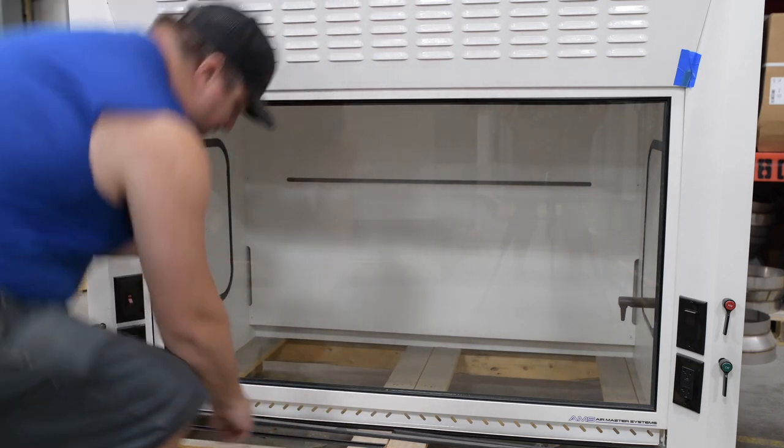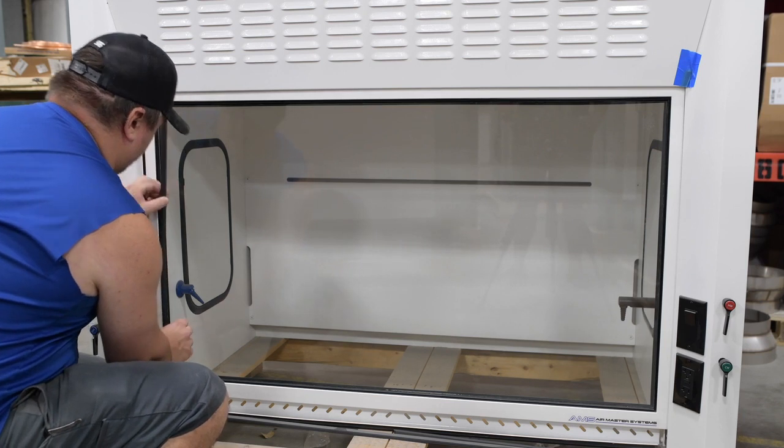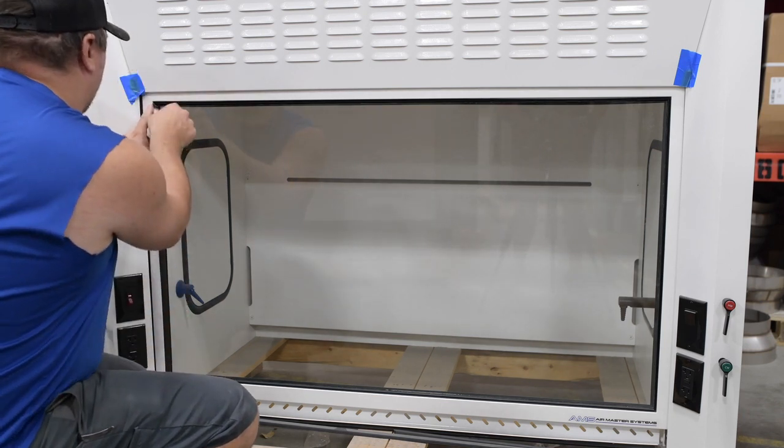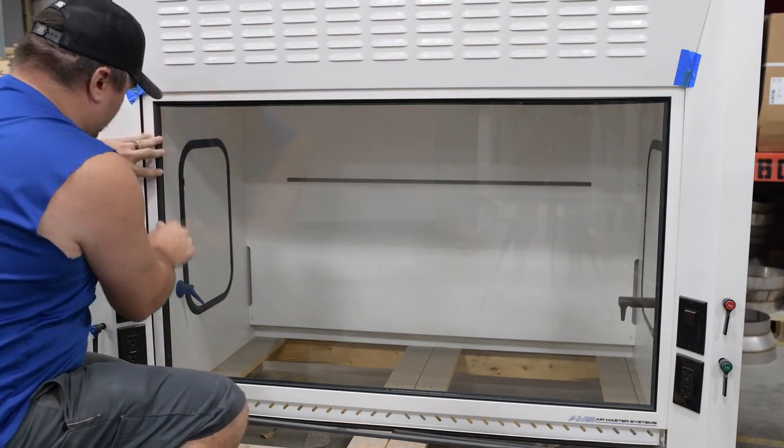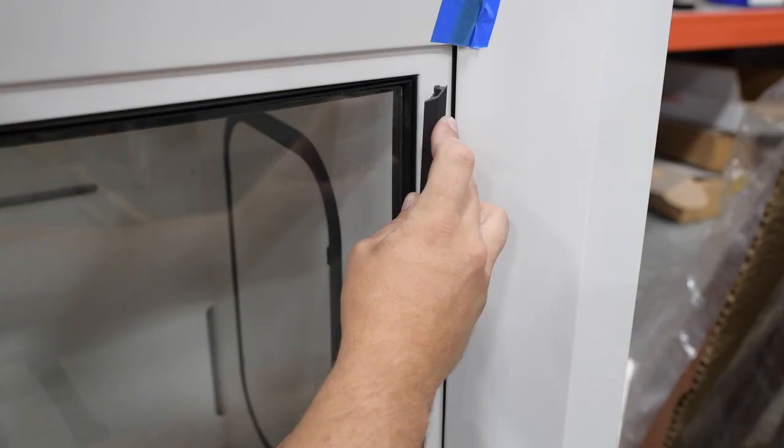You can reuse your previous sash trim to put the new glass into position. Start by sliding the sash trim into the correct spots and put pressure on them. You will notice that the ribs will click into place between the sash and the metal housing.